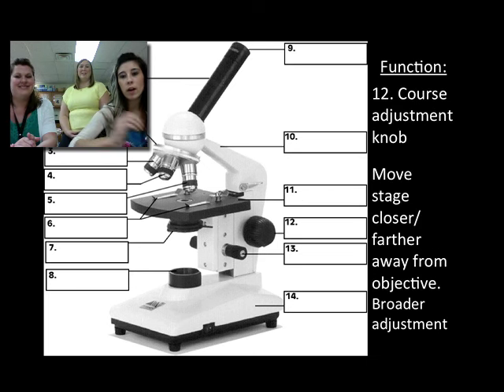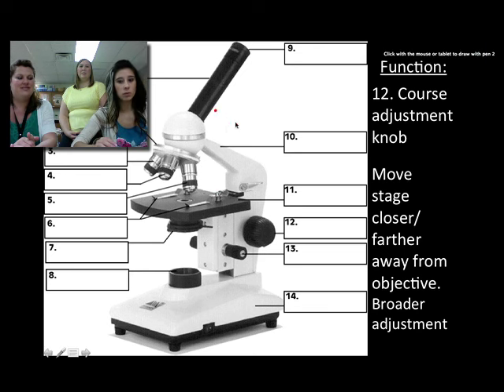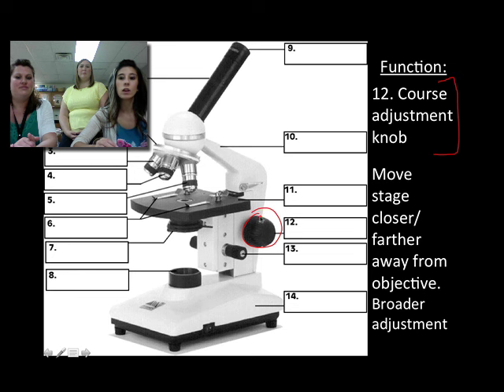Number 12, you can see it right here because we ran out of space. It's called the coarse adjustment knob. This knob helps you move the stage up and down. If you want to get something in focus, you use this. It's used for broader adjustments, so this is what you'll typically use at your scanning objective, that first objective.